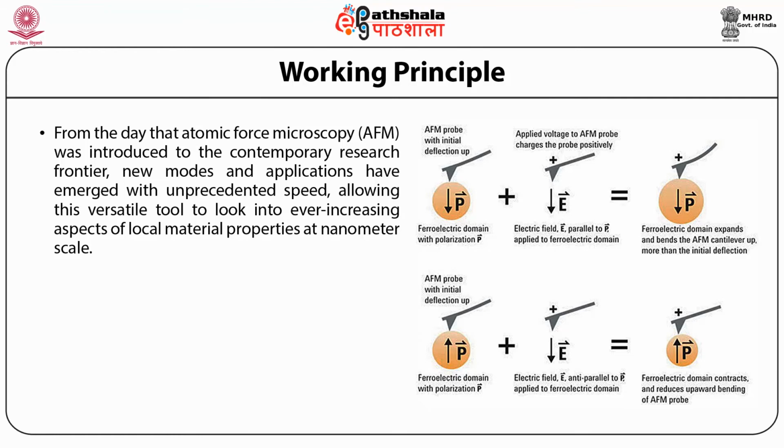PFM is one such novel mode which has gained increasing recognition for the unique information it can offer on the electromechanical coupling characteristics of various ferroelectric, piezoelectric, polymer, and biological materials.